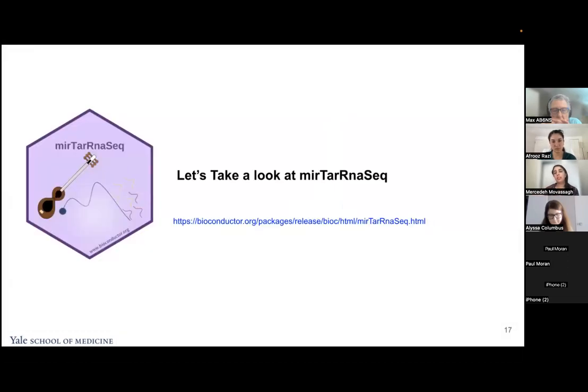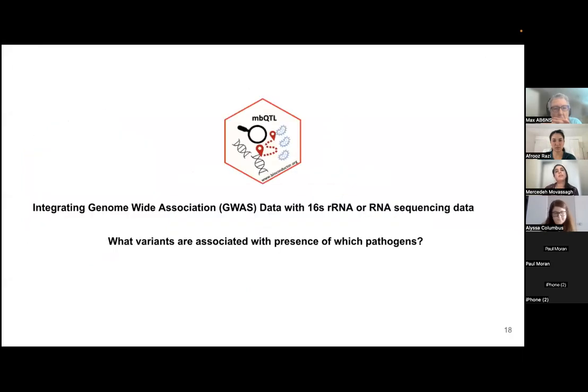So you can look at the vignette, it's pretty well described, and feel free to always send out an email and ask questions. It has had a lot of audiences, and to my knowledge, it's the only package that's data set specific for microRNA analysis.